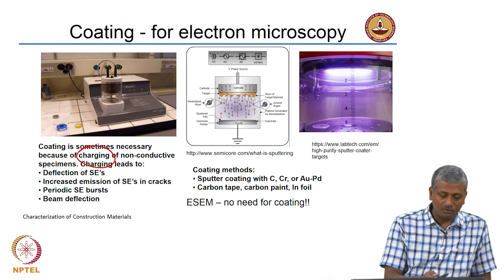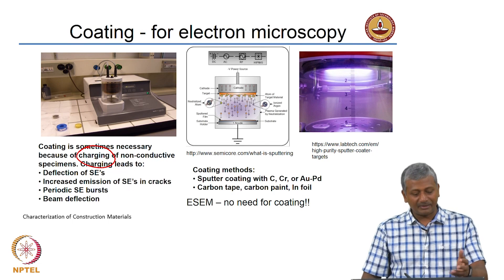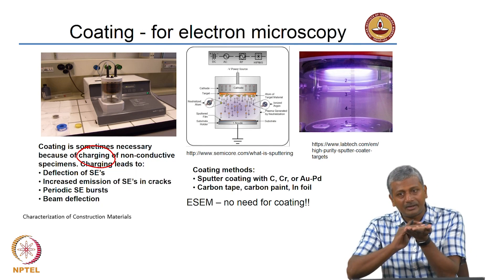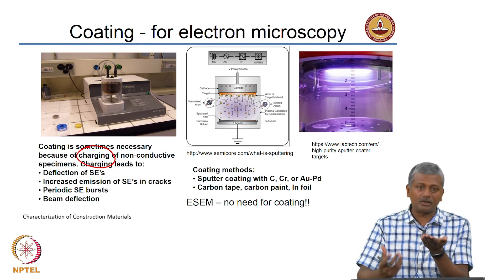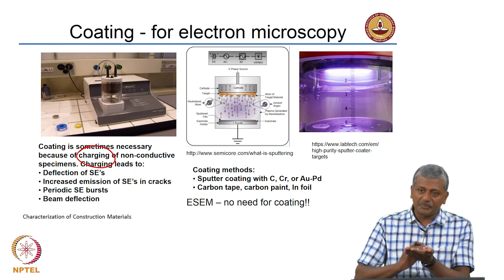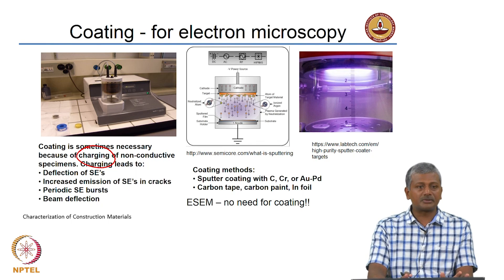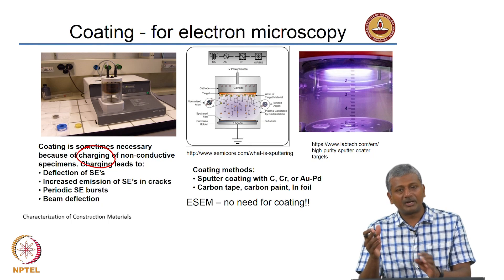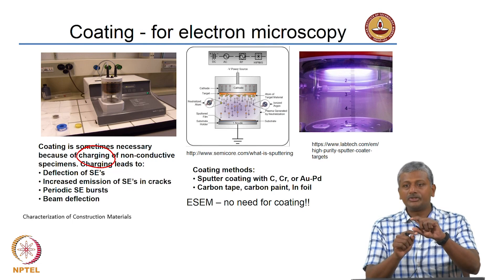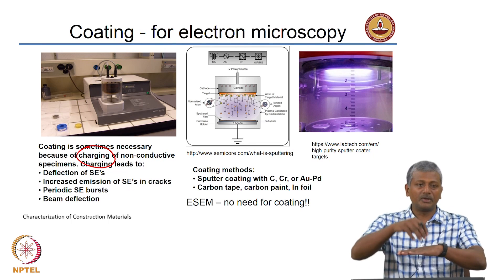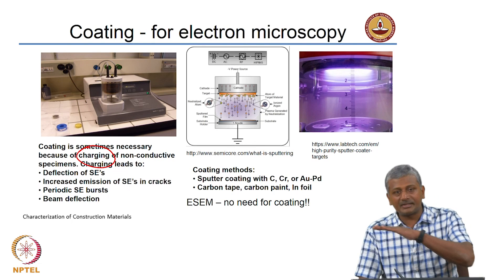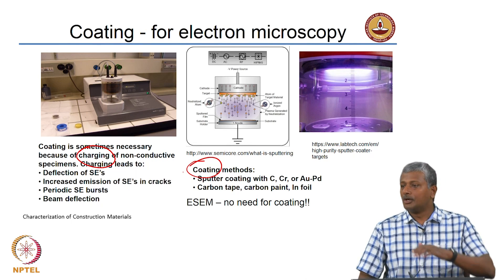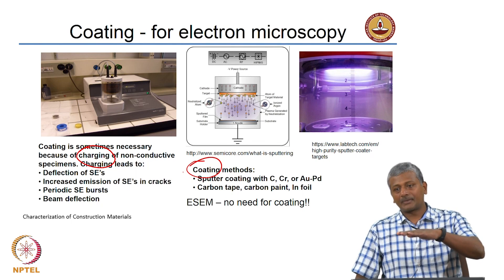Charging causes the resulting image to appear completely white and leads to other problems such as deflection of secondary electrons and beam deflection. To avoid this, we need to make the surface of the non-conductive material conductive. So if you are dealing with asphalt concrete or cement concrete and want to image it in the scanning electron microscope, you need to make the surface conductive. This problem does not arise with light, since any material will reflect or transmit light depending on its opacity.